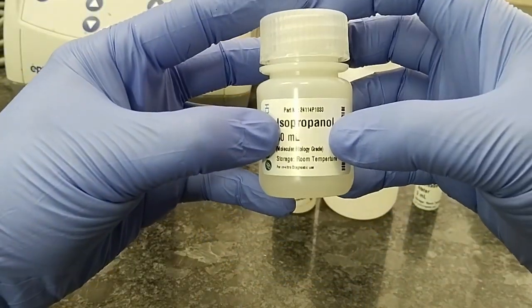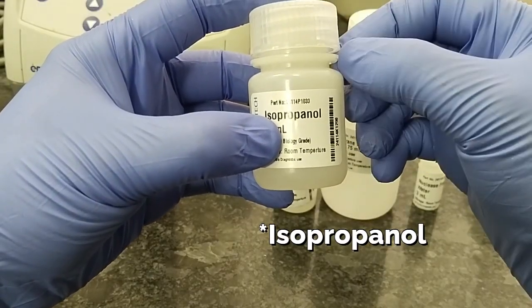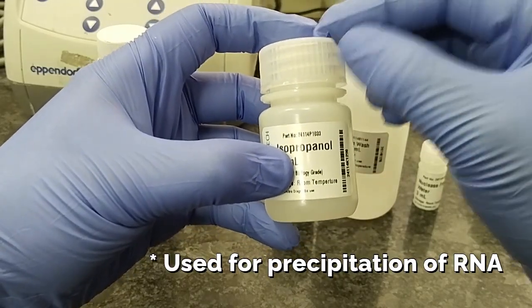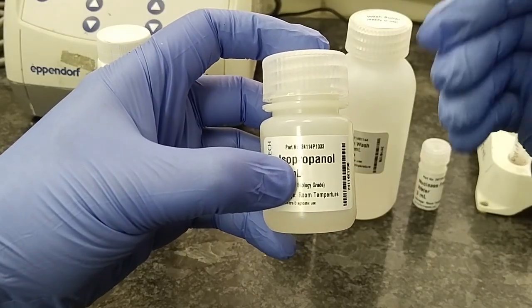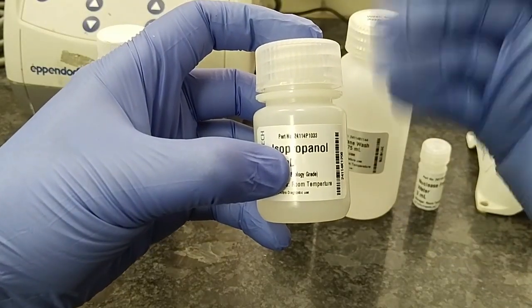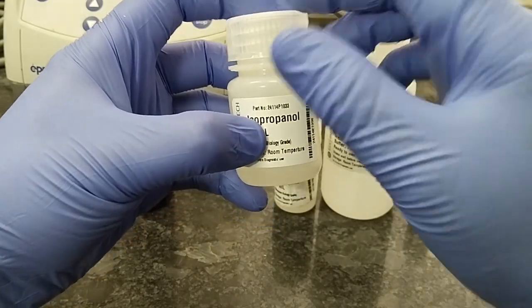Second reagent is isopropanol. Isopropanol is one type of alcohol. It is used for the precipitation of the RNA. In molecular biology, the role of alcohol is very crucial. It precipitates the DNA or RNA. Actually, DNA or RNA is water soluble. So isopropanol or any type of alcohol, it may be ethanol, it may be methanol, makes the DNA or RNA insoluble so that it can precipitate.